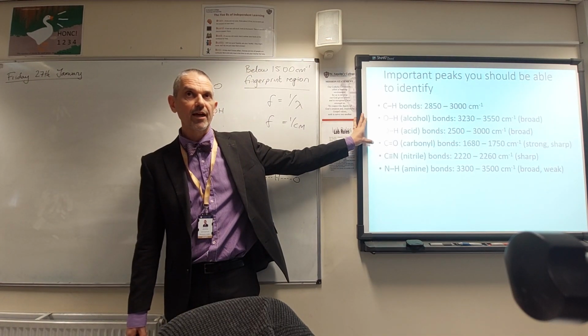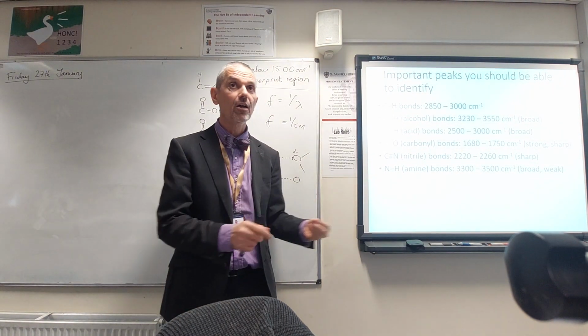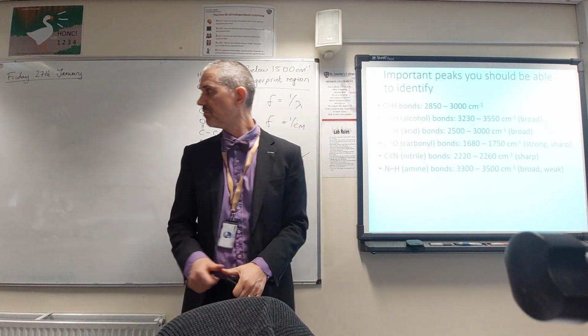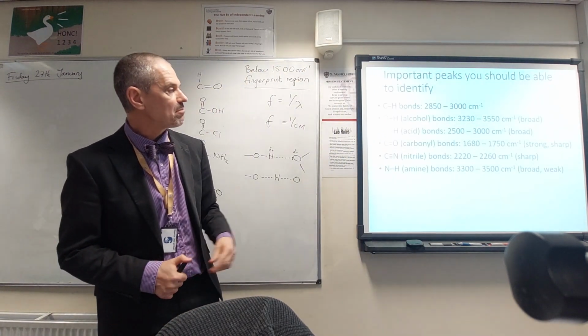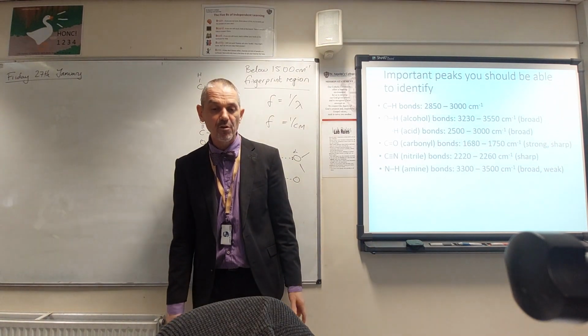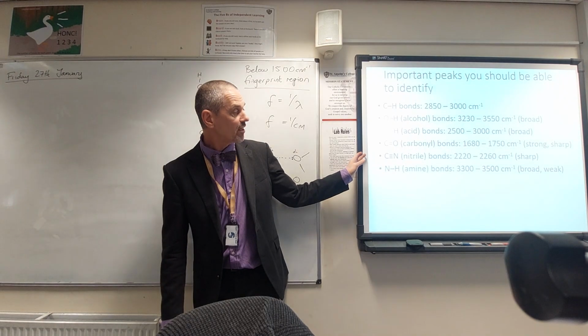And again, knowing what the peaks look like or are supposed to look like will help you spot them, as well as just reading off the numbers. There's a couple of others that have crept in over the years, and they're on the back of the booklet there. So let's just have a look at those.